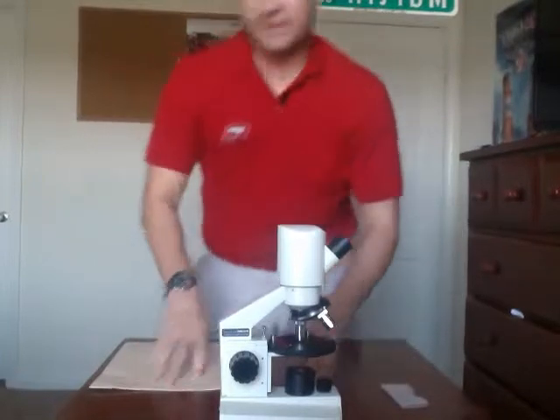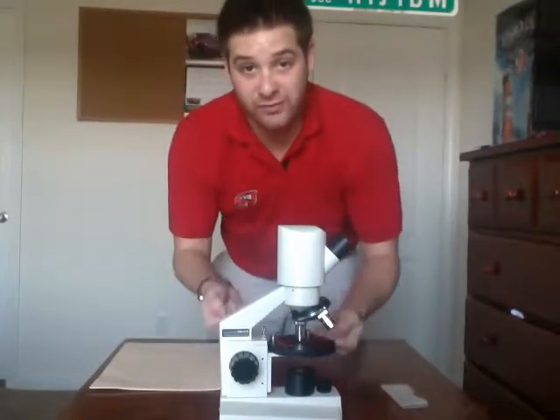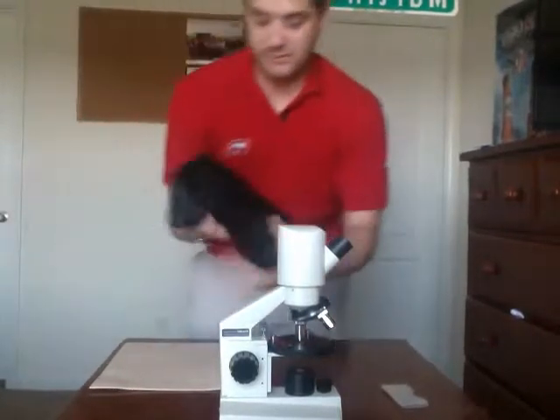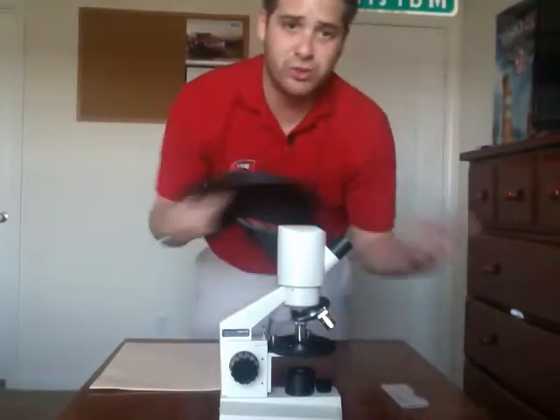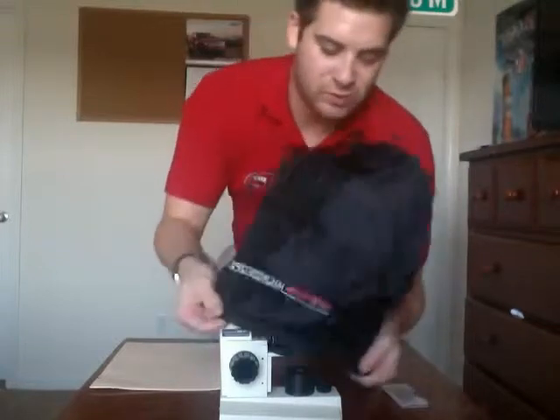Once you have done that, you will then want to take your dust bag and place it over it, which the majority of teachers have, because you don't want dust on your microscopes or on the lenses. Once you place that on there, once again, remember to grab it with one hand on the arm and one hand underneath of it and have it about chest high when you're carrying it, walking it back to where you got it in storage.